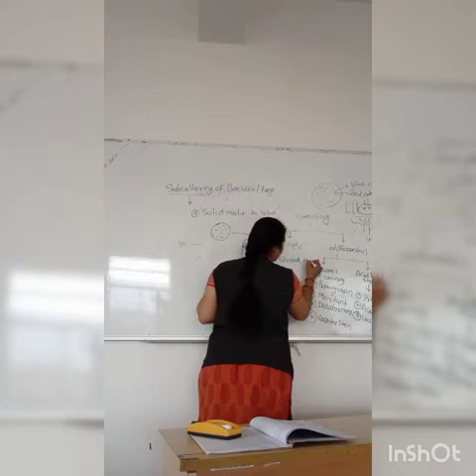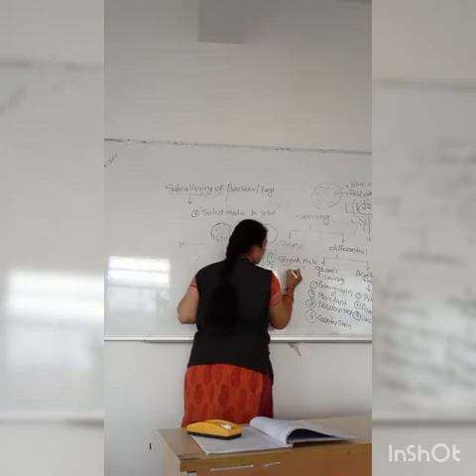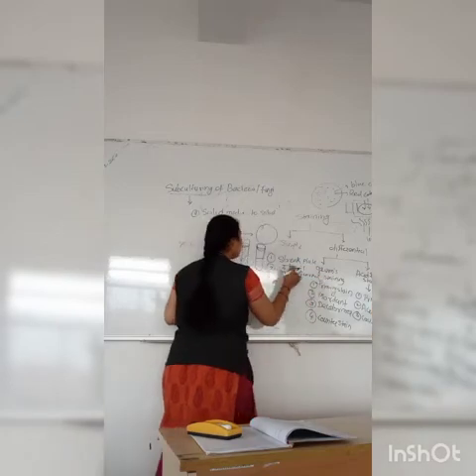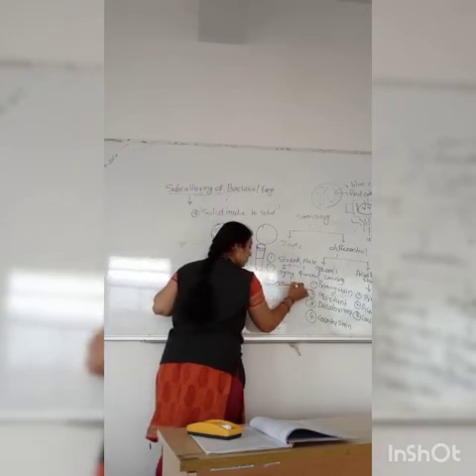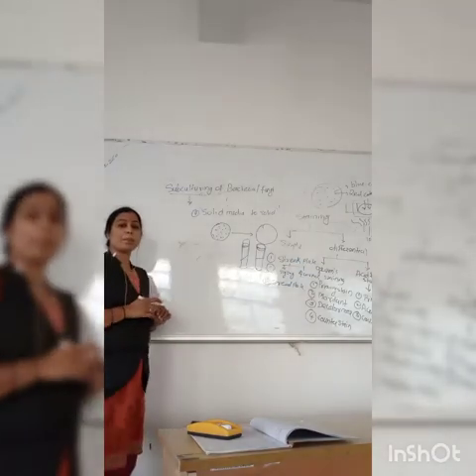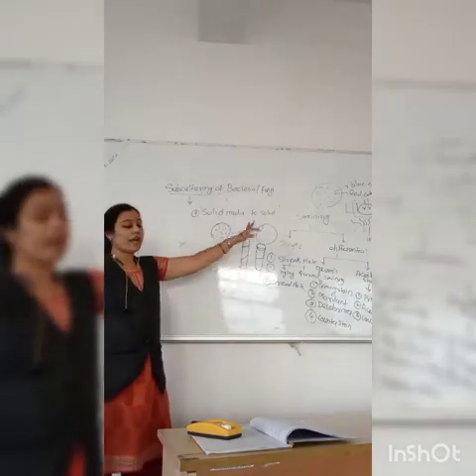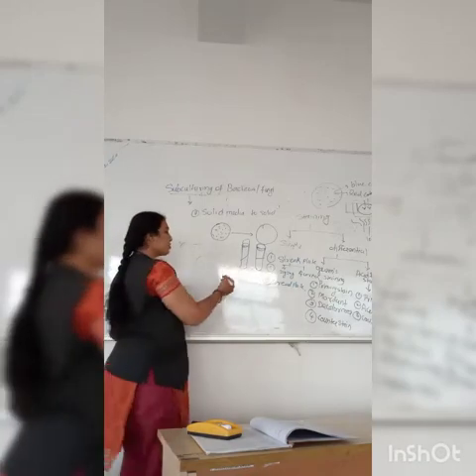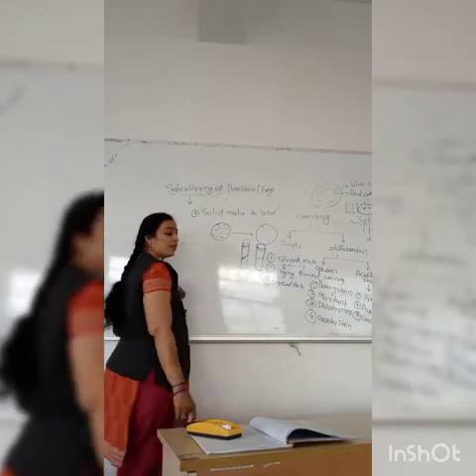There are two streak plate methods, zigzag and four corner, and the second one is the spread plate method. By these plate methods you can subculture the given culture, that is solid to solid. And if you are thinking to transfer it onto a slant, just prepare the nutrient agar slant and streak on the nutrient agar slant.